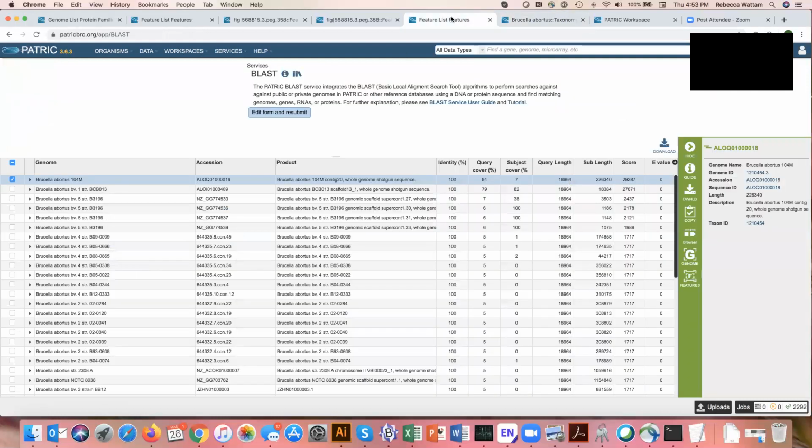When we did BLAST, we got really good hits to only 2 of them and a partial hit here. And then the rest is kind of, you know, not so great. But these are the 2 best ones. So that's how you can use BLAST, going from a genomic region and seeing how strongly it's conserved, or if you can find it somewhere else.